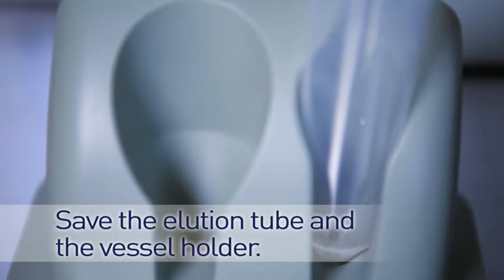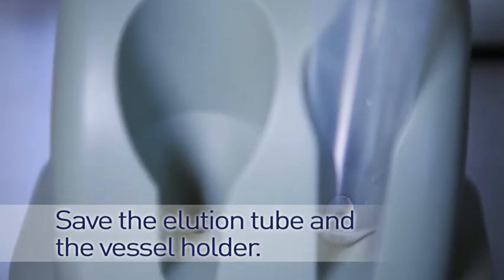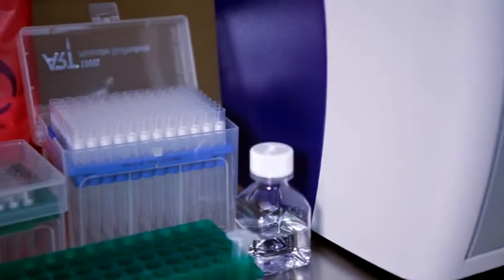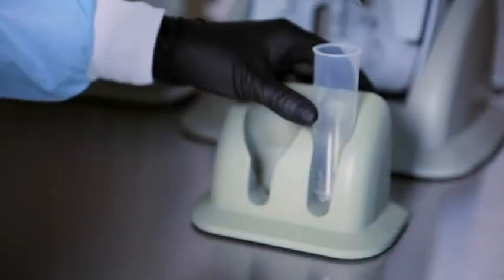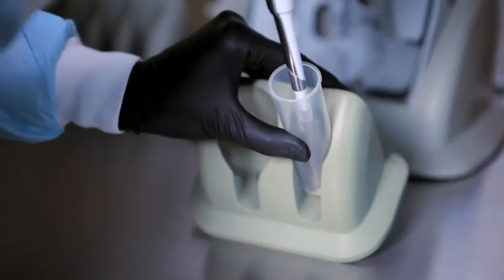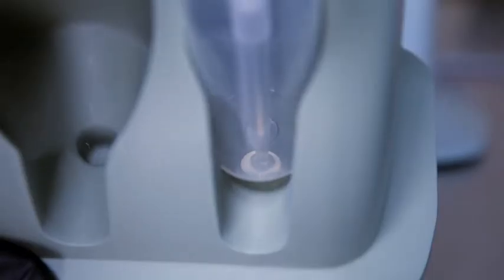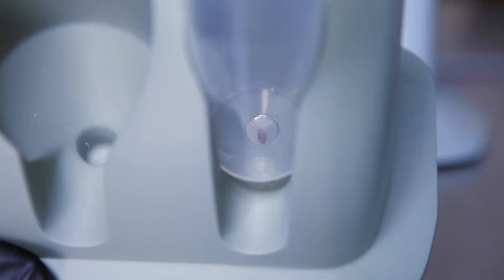Save the elution tube and the vessel holder. The elution tube holds the auto beads and the holder is where the magnets are located. To re-suspend the beads, leave the elution tube in the holder and use a pipette to remove any remaining PBS wash buffer. Be very careful not to displace any beads from the magnet.